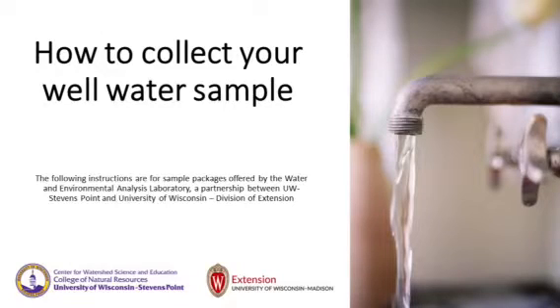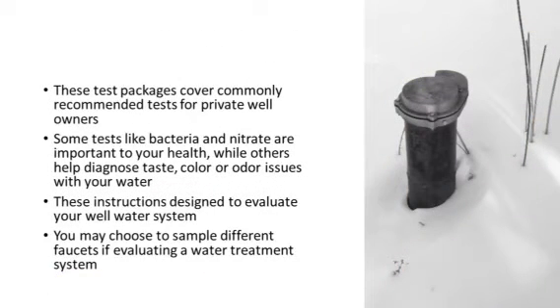In this video, you're going to learn how to collect your water sample for the test packages you selected. These test packages cover some of the more commonly recommended tests for private well owners. Some of the tests are going to be important to health, while others will help you diagnose aesthetic concerns associated with your water. These instructions are going to be appropriate for most well water systems.